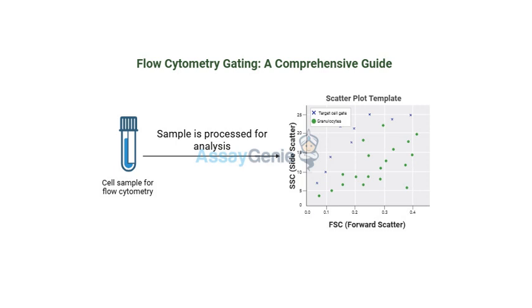Now imagine you've spent hours carefully putting together this case, building your theory. Don't you think you'd want to double check it? Make sure you didn't miss anything? Oh, for sure. One tiny mistake and the whole thing could fall apart. Right. Well, in flow cytometry, we can double check using something called backgating. Backgating? Is that like time travel? Not quite, but it does let us look back and check that our strategy is right. It's like retracing our steps, making sure we didn't leave anyone out or put someone in the wrong group. Oh, okay. So it's like reviewing the security footage, to see if anyone slipped through.